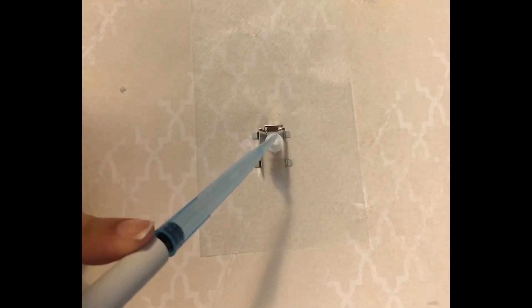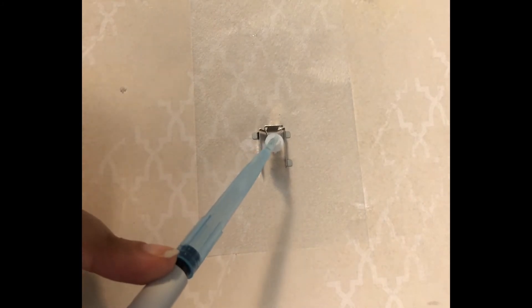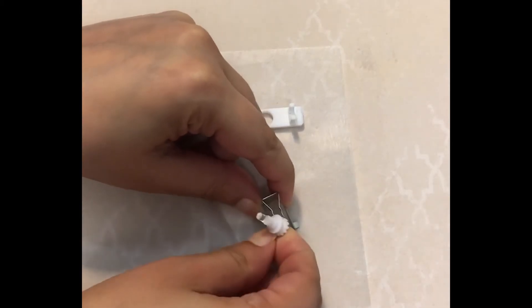Next, add the sample into the tube. Seal the tube with agarose and allow it to set. Attach the tube and the sample holder and rotate the tube to align the sample.